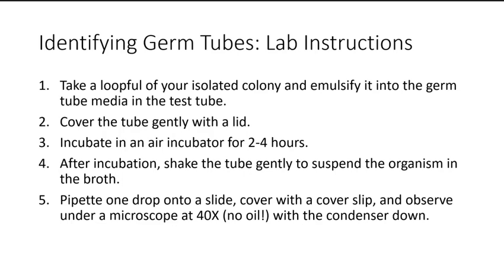So here's the lab instructions. You take a loop full of your isolated colony and you emulsify it into the germ tube media in the test tube. It's all liquid, so you kind of mix it in there. And then you cover the tube gently with a lid. If you put the lid on tight, as the broth heats up in the incubator, the lid will pop off and shoot off somewhere in your incubator, and then you won't be able to find it. So make sure you just cover it lightly.